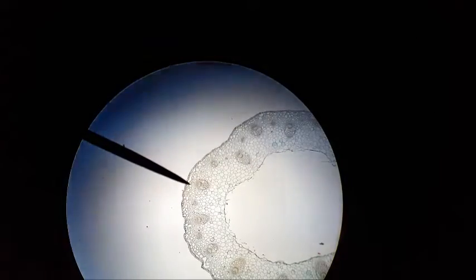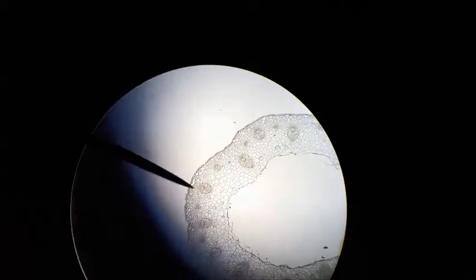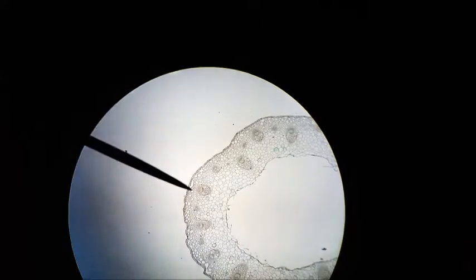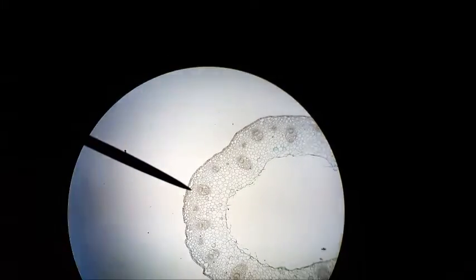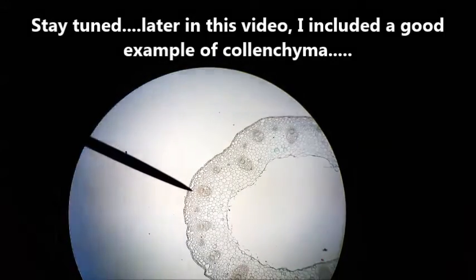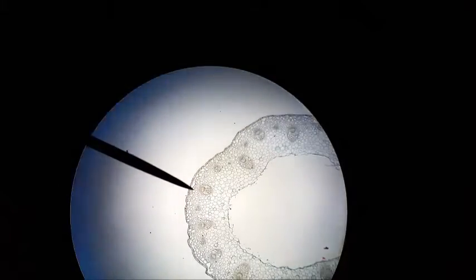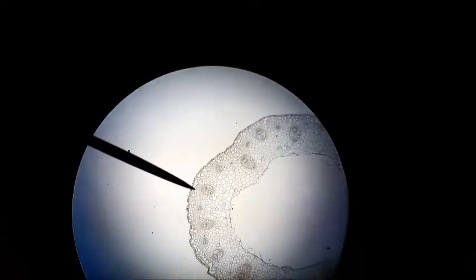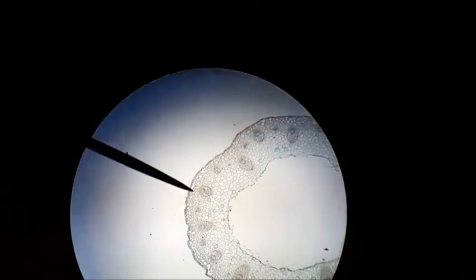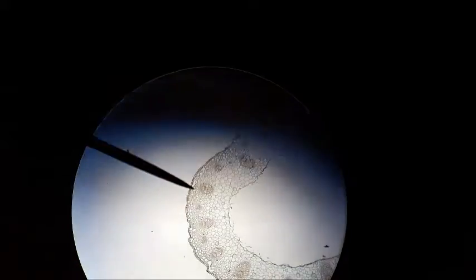The area between the epidermis and the vascular elements might be called chlorenchyma if it is made of parenchyma cells which have chloroplasts and photosynthesize, or it might be named colenchyma if the cells are made to reinforce and strengthen, specifically at corners. This does not have distinct corners, so it may be a toss-up as to whether this should be called chlorenchyma or colenchyma in this cortex region.